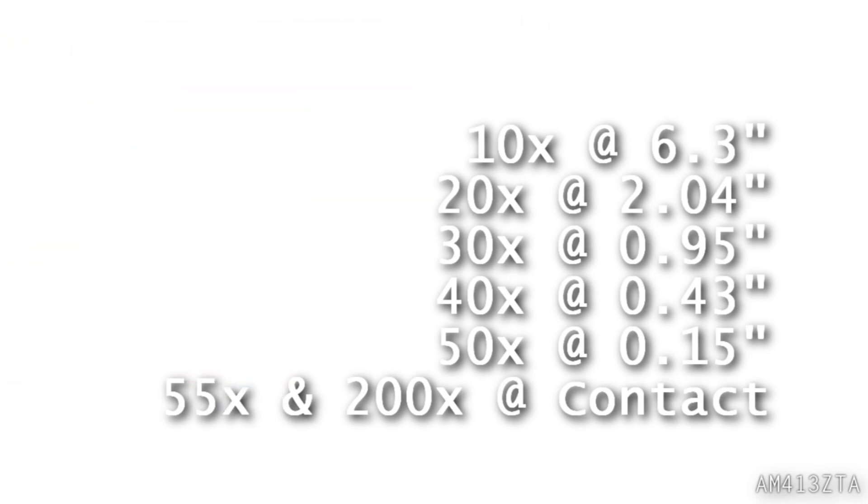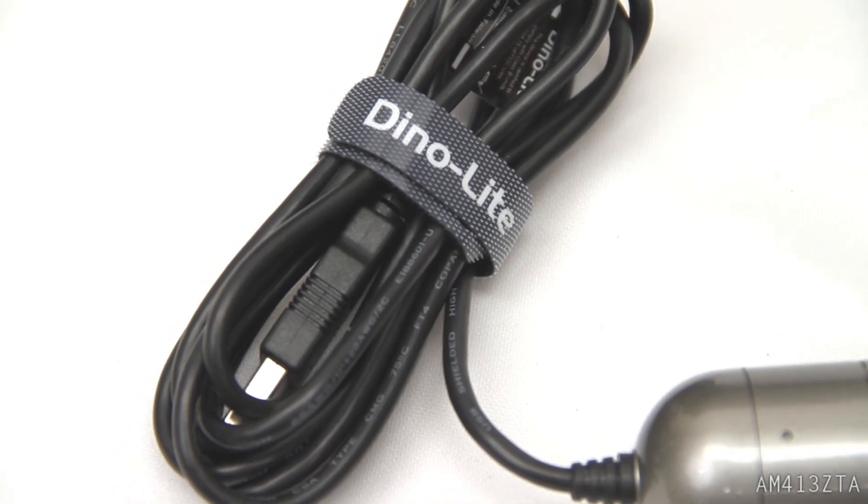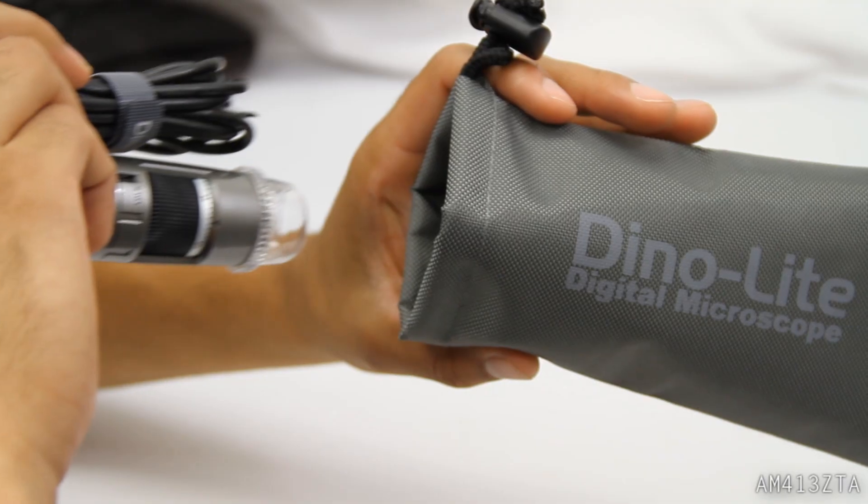Inside the box is the AM413ZTA, lens cap, a Velcro strap, carry pouch, holster, software CD, and calibration slide.